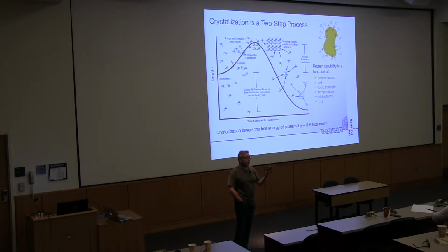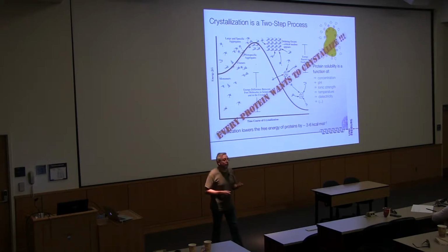In practice, that means you make your crystallization drops, you look at them 5 minutes later, then an hour later, then half a day later, and a day, and a day, and a day, and you start to get really bored and you don't see anything happening. And then after a week, you go there and you find huge crystals that were not there the day before, because these are two different processes that can have very different kinetics. But the entire thing in basically all cases is energetically favored, so every protein in fact wants to crystallize. Not every protein knows that.